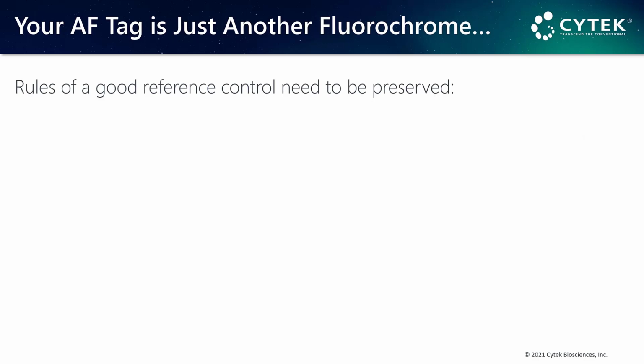As far as the unmixing algorithm is concerned, any autofluorescent tag in your assay is just another fluorochrome, one for which we need to provide good controls that meet all the rules of a good reference control, just like all your other single stain reference controls.